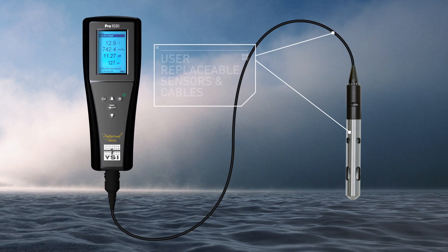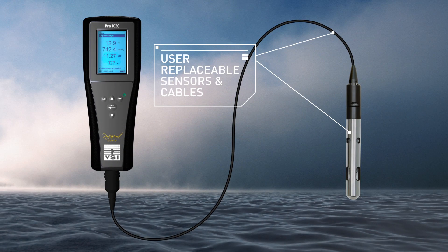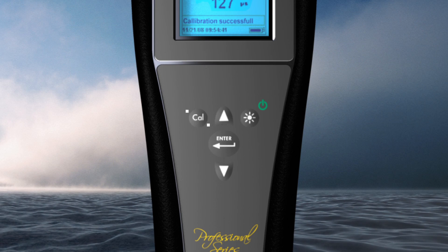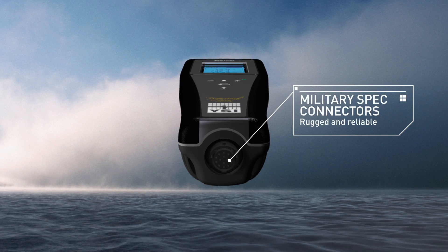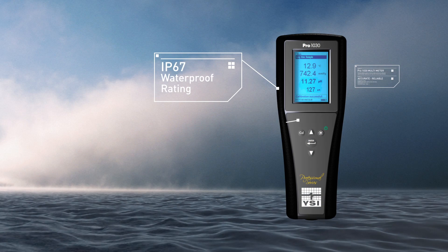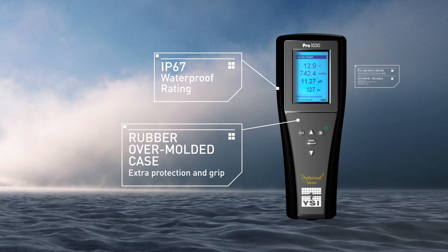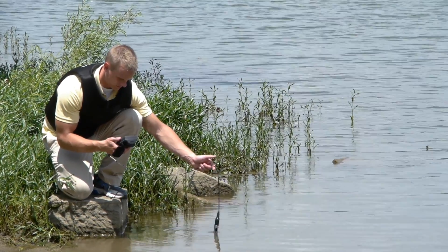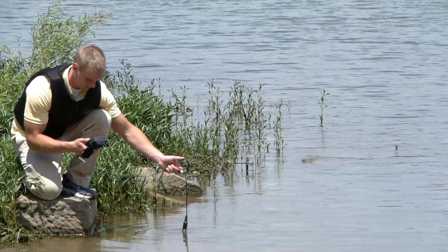User-replaceable sensors, pH and ORP sensors, and cables, and a convenient calibration routine make it extremely user-friendly. Military-spec connectors, IP67 waterproof and rubber-over-molded case, and 1-meter drop tests ensure the instrument remains in your hands to provide years of sampling, even in the harshest field conditions.